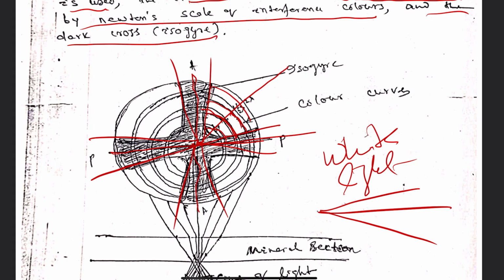So each ring, all the light rays coming over this ring, this ring, this ring, they have the same amount of inclination with respect to this axis. That's why if this is the deepest dark line, it will become fainter and fainter in this direction, and it will have a faint line like this on both sides.